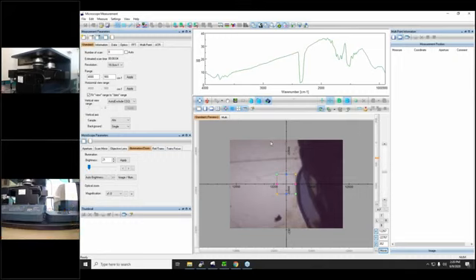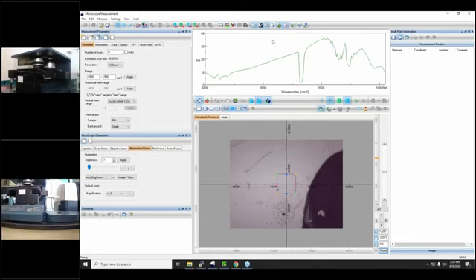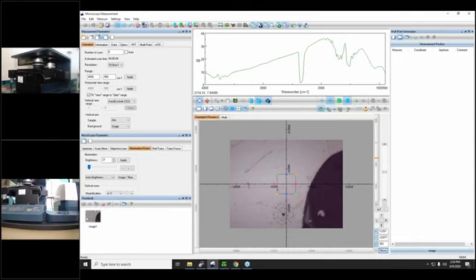Okay, on this side is the FTIR bench. The light goes to the FTIR microscope, and we do the measurement. This is an automated stage, so we can use the stage to take different pictures. One of the features that I really like from the software is that, starting here, we can take images, and these images can be saved later.